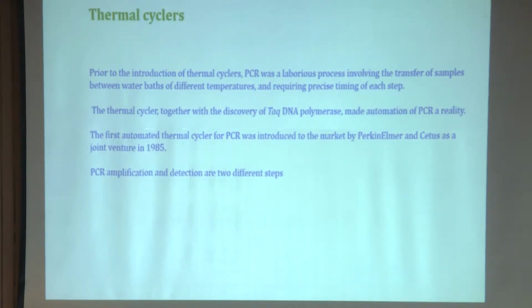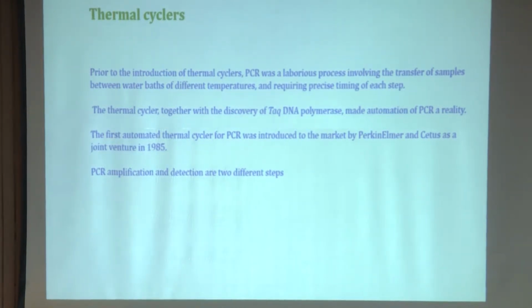So those things have been discontinued, and they are able to bring automation. That made the job very easy for us. Once we have PCR machines with thermocyclers, we are able to amplify the templates to the level which we want. We are able to have a good amount of study material for all our analytical purposes. So amplification made things very easy.